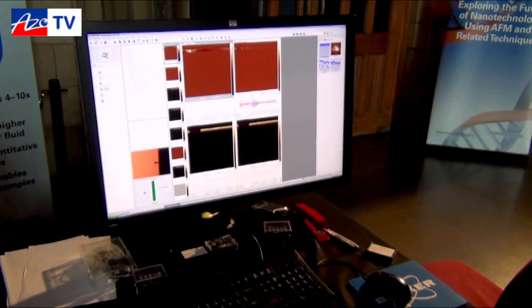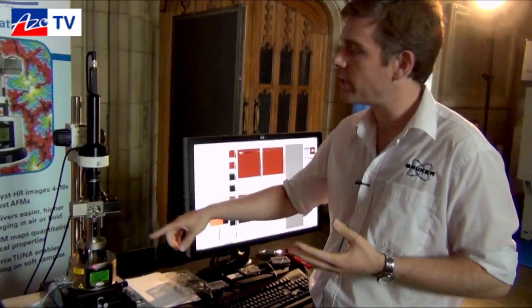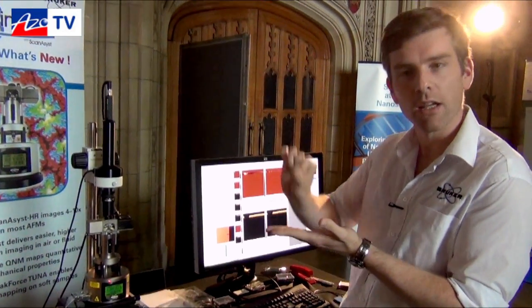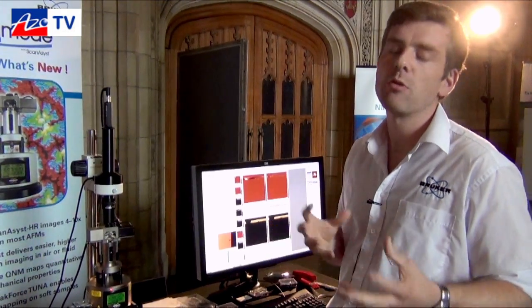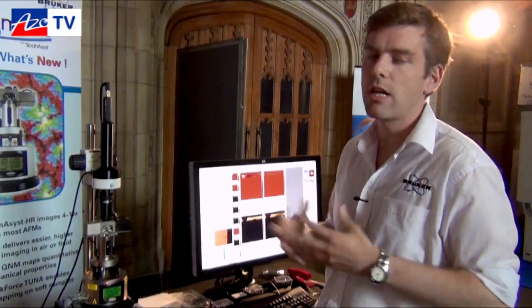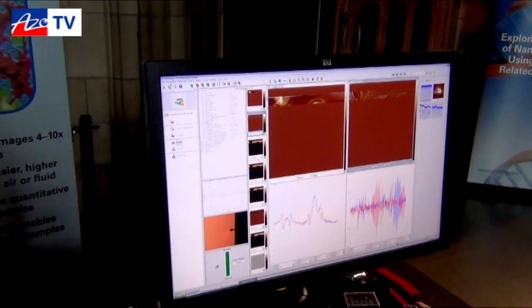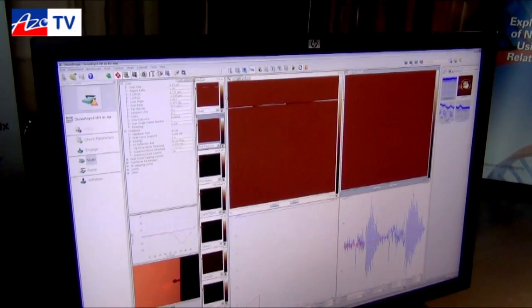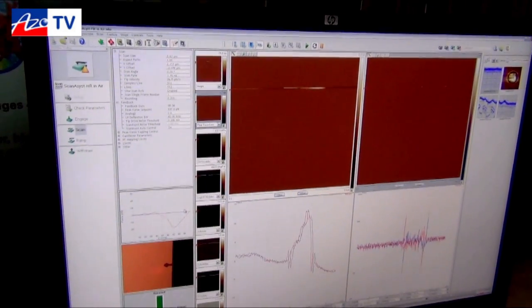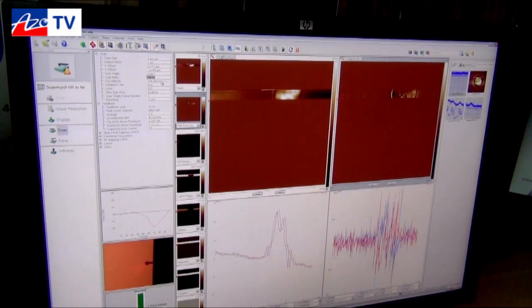Finally, on the back of ScanAsist we also launched a product called ScanAsist HR, where instead of oscillating the scanner up and down at 2kHz, we move the drive into the cantilever holder and with a piezo stack we move up and down at 8kHz. This allows us to image somewhere between 4 and 6 times faster with the same resolution on your multi-mode system, to do survey scans, get fast topography, and generally improve the AFM experience. This button switches between scanner excitation and cantilever head excitation; we switch to the 8kHz drive, ScanAsist self-optimises at this new frequency, and this allows us to increase the scan rate — for example from 2 to 6Hz — to scan significantly quicker.